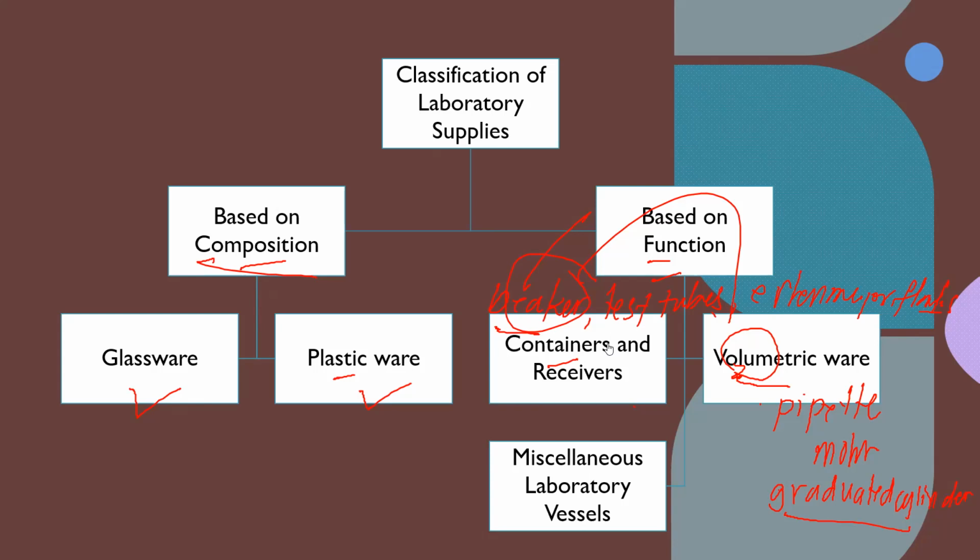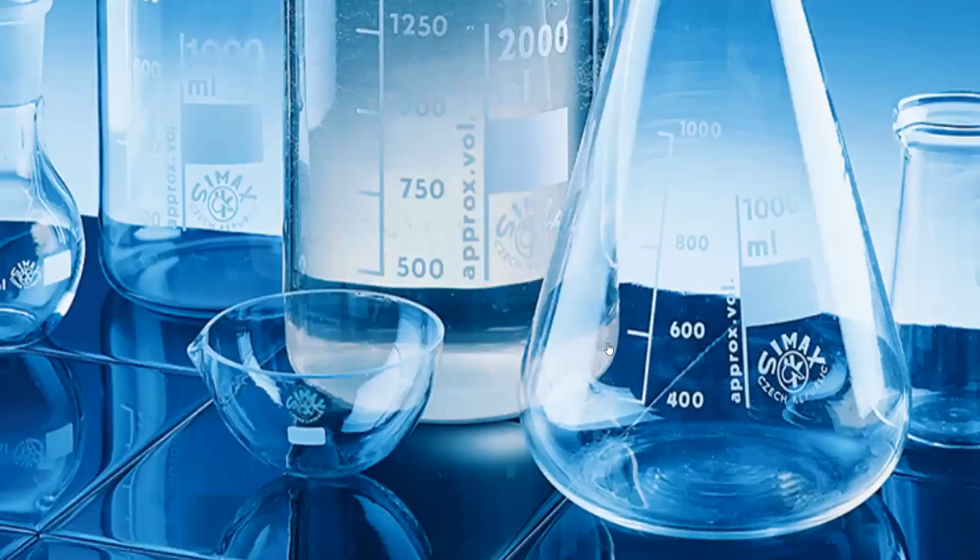And lastly, we have our miscellaneous laboratory vessels. Even though they are termed miscellaneous, they also have their importance and relevance in the clinical laboratory, particularly in the clinical chemistry laboratory. What you can see in this illustration, yes, you are correct, are what we call glasswares.